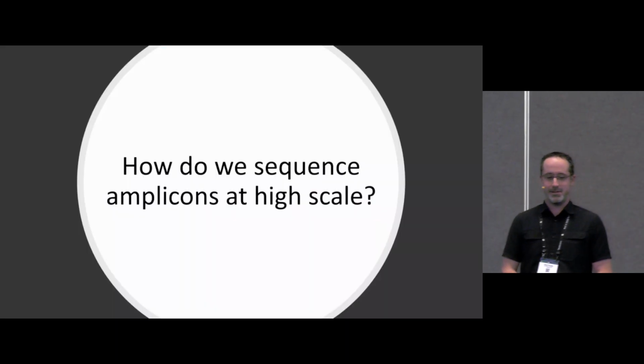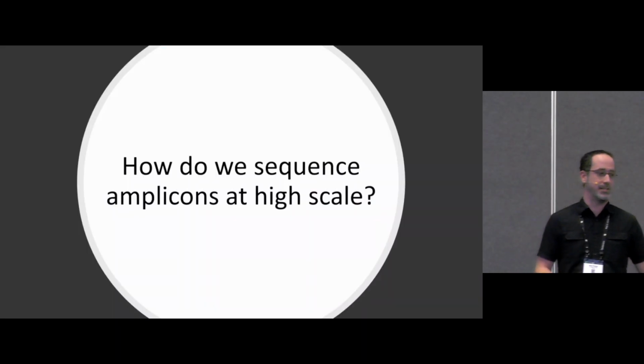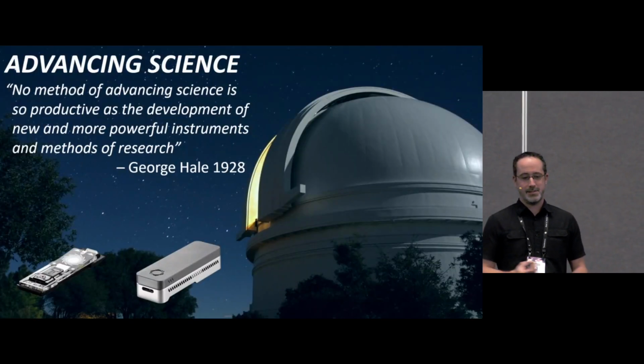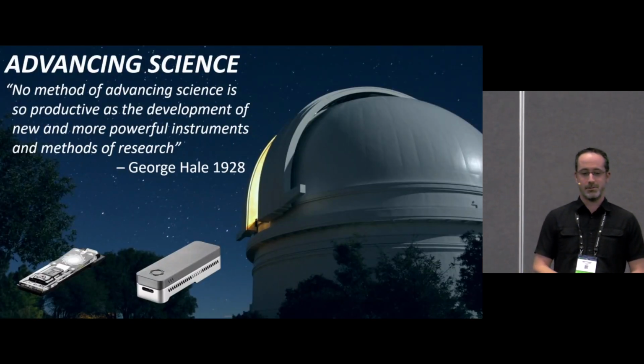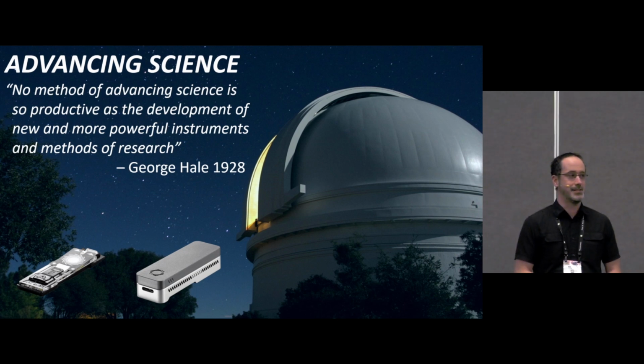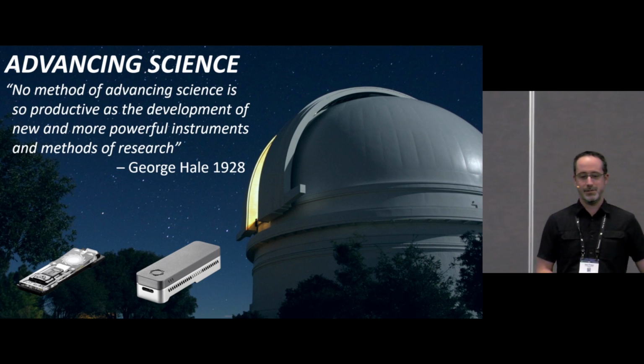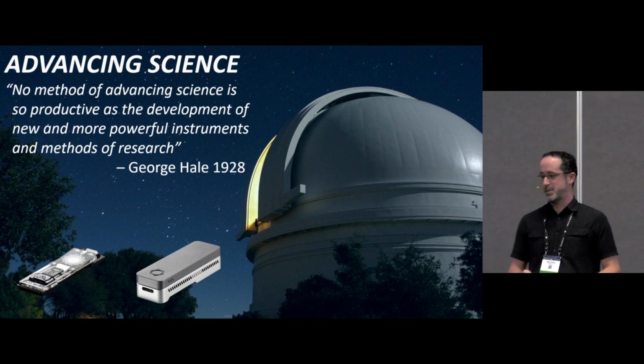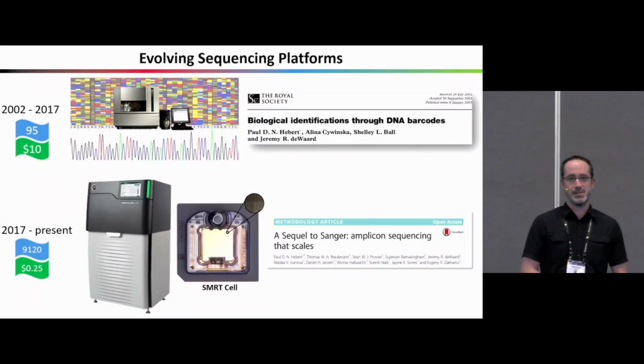All right, getting back to it, now I'm going to talk about how we actually sequence amplicons at a large scale. I like to start with this nearly century-old quote: "No method of advancing science is so productive as the development of new and more powerful instruments and methods of research." This is especially true for sequencing platforms.